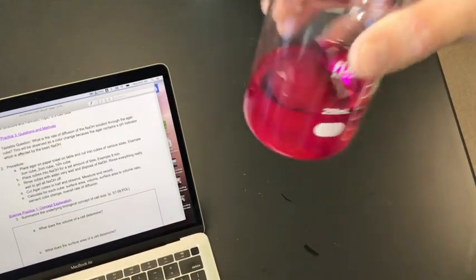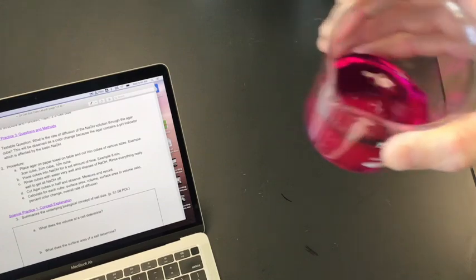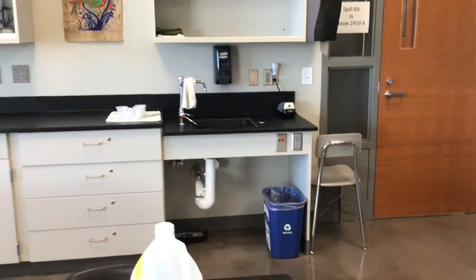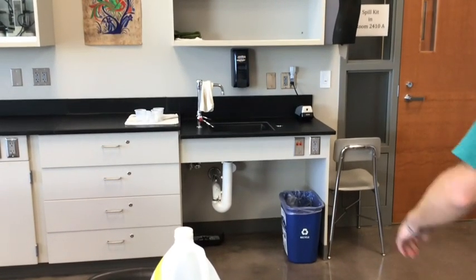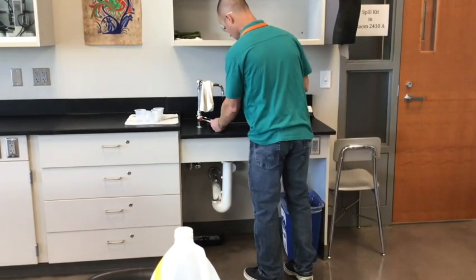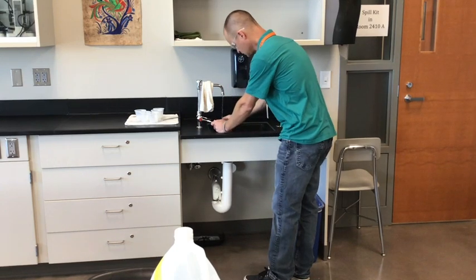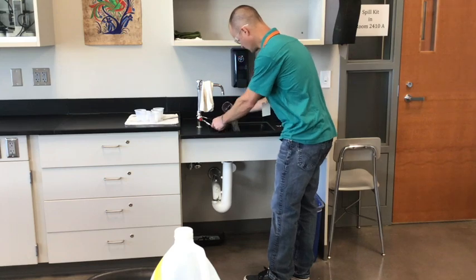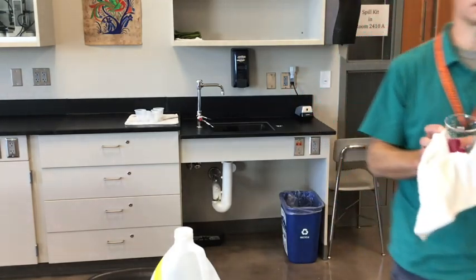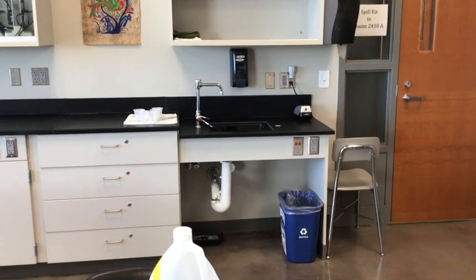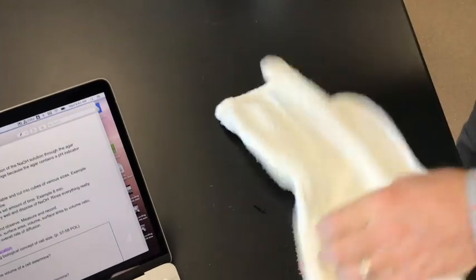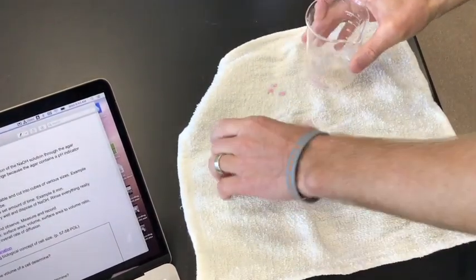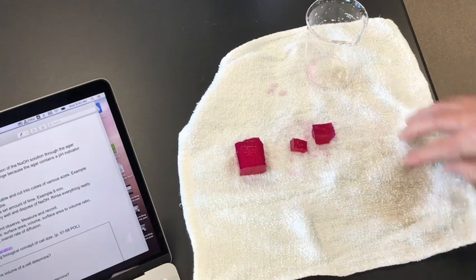As you could see, I really wanted to get the sodium hydroxide off of the cubes. I don't want to bring any sodium hydroxide back to my table. So there's the cubes.